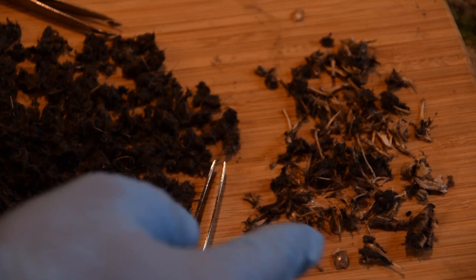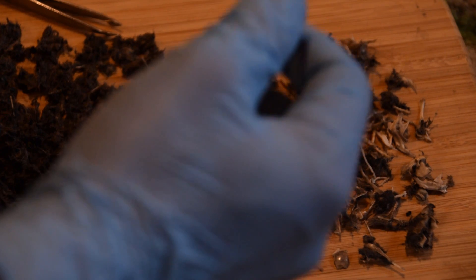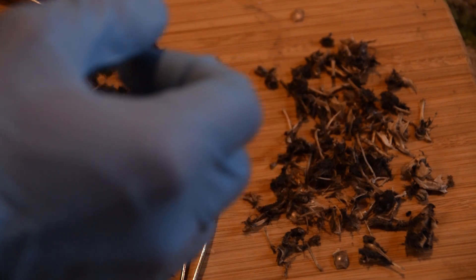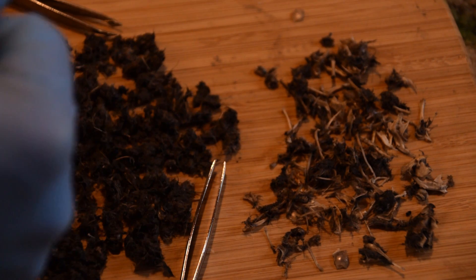Now what I'm going to do is take all of these bones that I've gathered and put them in a bowl of water so we can clean them off a little better. I'll take it outside so we can get a really good view because the lighting is getting bad inside. So let's clean these up and go outside.